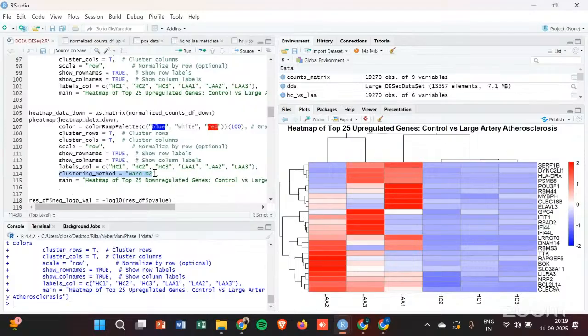This uses something called Ward's distance as the linkage method. Ward's distance basically focuses more on minimizing total within cluster variance. So complete linkage maximizes between cluster variance, while Ward's distance minimizes within cluster variance. Ward's distance tries to minimize the distance between each sample within a cluster, and that is why it is less prone to outliers.